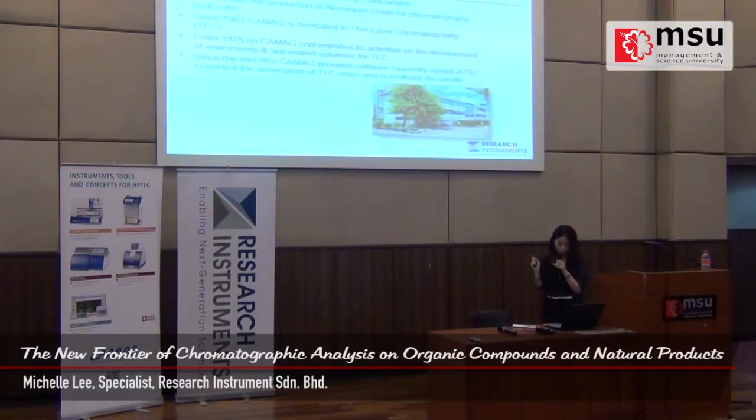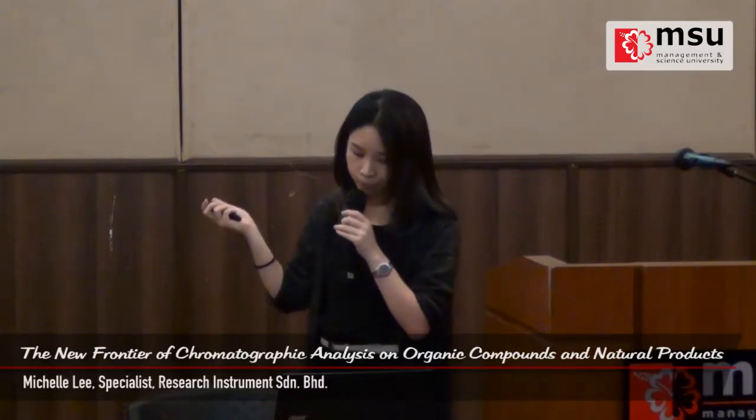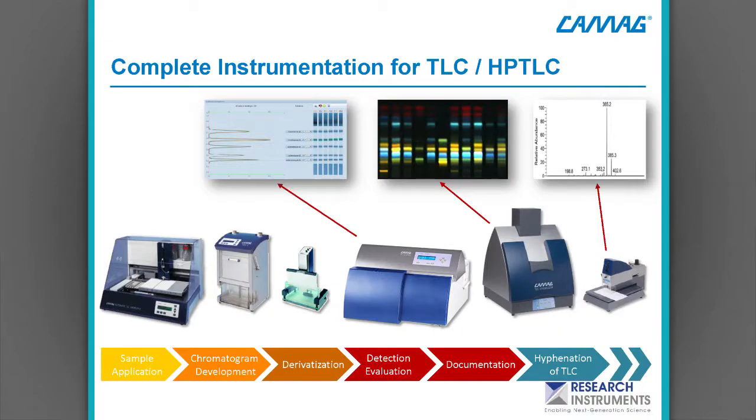Okay, before I go into the instrumentation, just to share with you, the instrumentation is under the brand Camag. It's a Swiss brand. They develop their own instruments and software as well. So I would say TLC is a very flexible technique, okay? This is the series of instruments that helps you to do it.